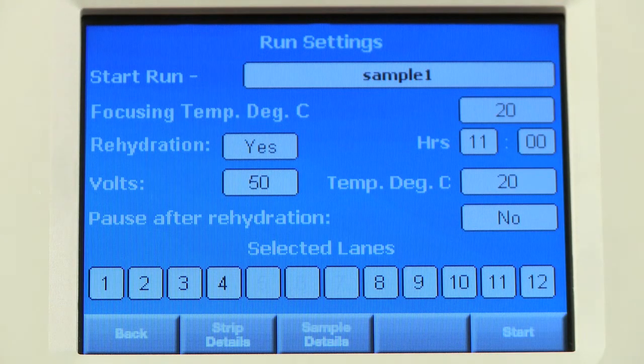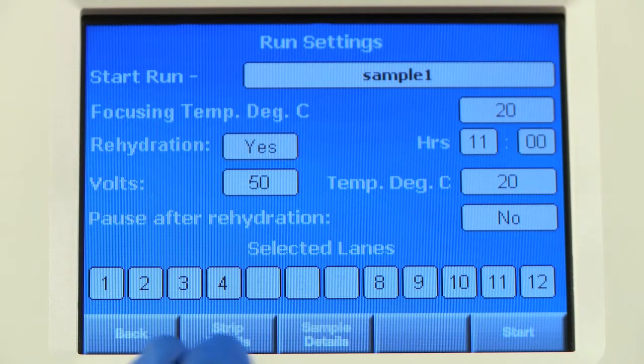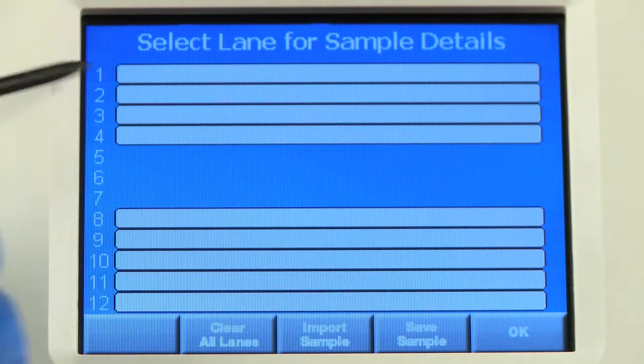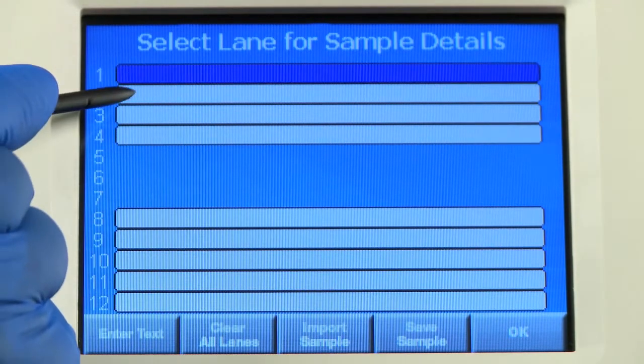Press Sample Details if you would like to add information about the sample in that strip.